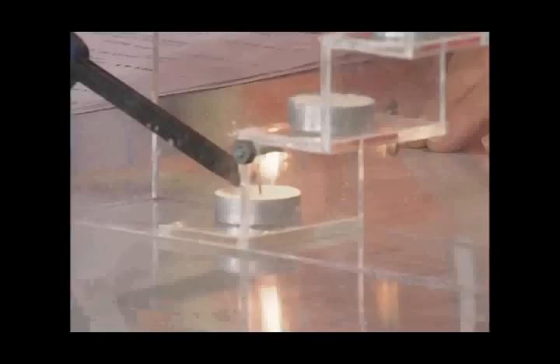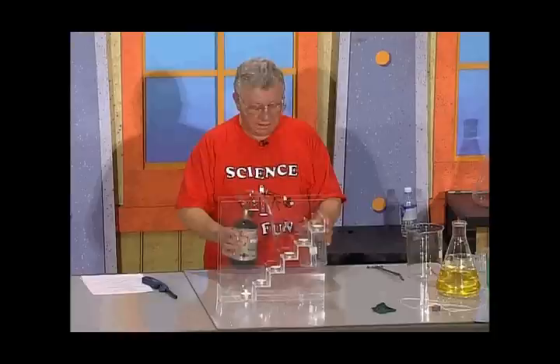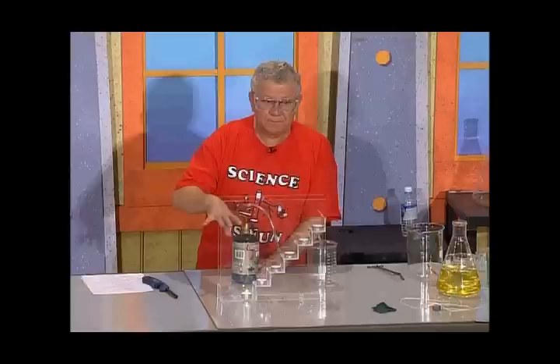Let's go back to those candles that are over here, and I want to try to light them, but let's see if I can light them in a different way than I did before. So I light the one at the bottom, I take my carbon dioxide filled flask out of there, and what I have here is a propane tank, a small propane bottle, and I have a beaker. The beaker is empty except for air. What I'm going to do is fill this beaker with propane gas. Propane gas has carbon in it, has hydrogen in it. It's a hydrocarbon. It is denser than air, and it also has an odor. So I open the valve like this, and you'll be able to hear it come through.